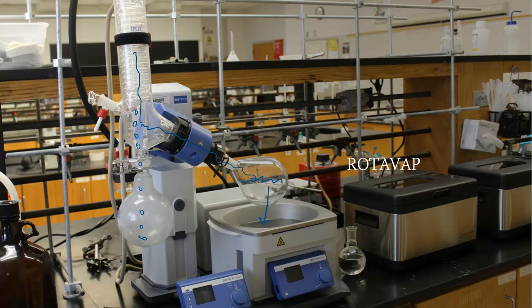We do this when there's a lot of solvent that we want to keep. If I look at this flask that's here, that flask has quite a bit of solvent in it, right? And that solvent's perfectly good. That's all it is, solvent and peanut oil. If I can evaporate that solvent off, and if I can collect it and keep it, I can reuse that solvent for other purposes. Maybe someone else wants to do a peanut extraction later on, or maybe petroleum ether when we have to use it for a different particular lab. As long as I confirm that this is petroleum ether, then I can reuse this for a different purpose at a different time on a different date.